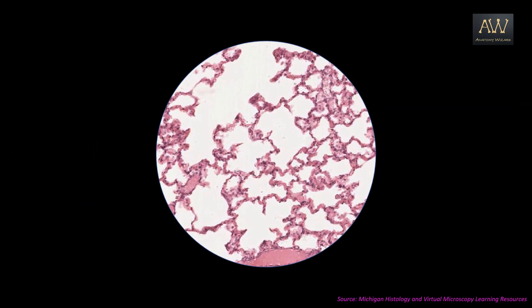As we saw earlier, in order to identify the epithelial tissue, we should look for the junction of any free space with the visible tissue on the slide. Now as we can see on this slide, there is lots of free space and there are interspersed thin layers of tissue, so there won't be a problem identifying the epithelium in this slide. We will now move on to a magnified view.